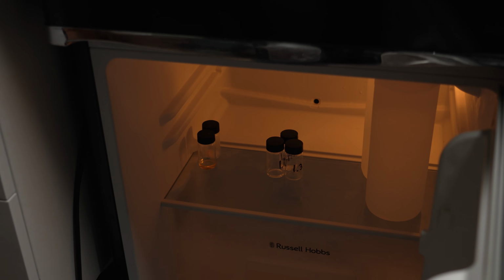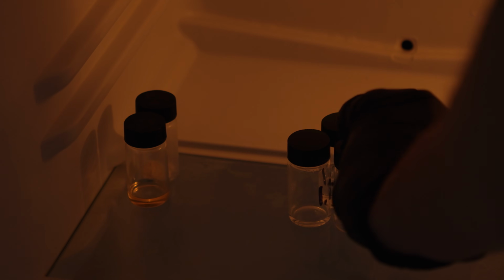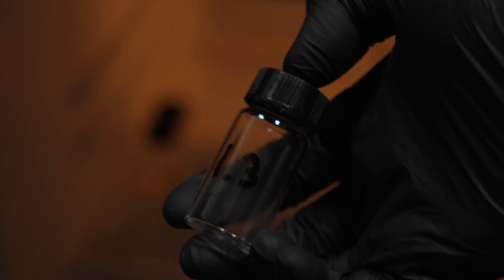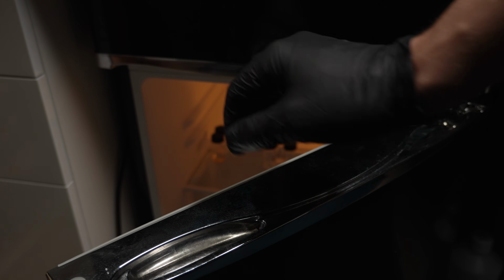I opened the fridge where I kept the vials, and suddenly there was a pleasant scent. Guess which one? Banana. I think that happened because only a tiny amount escaped past the caps, so the concentration in the fridge air was just right. That convinced me I'd actually made something I wanted, but still, the overall smell was very chemical and I didn't like it. I got disappointed and shelved the synthesis. I put the vials back in the fridge and moved on to other projects.